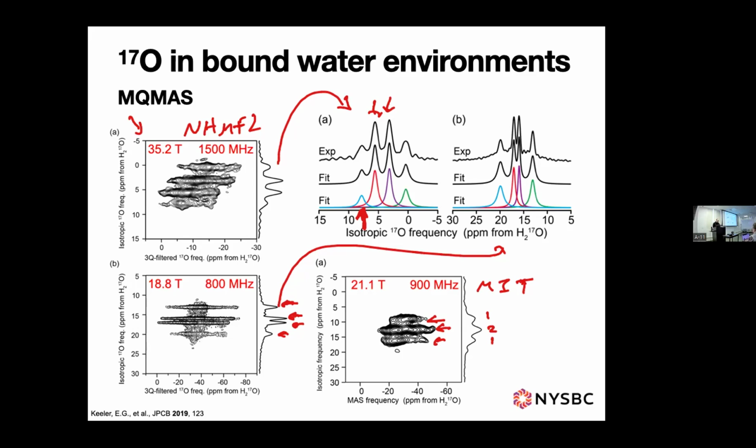They also did a different type of MQMAS that was just better. I would do what they did if I did it again, but this was probably taken in 2014, and this was taken in 2017. So we worked out the data a long time before we ended up with the other data.